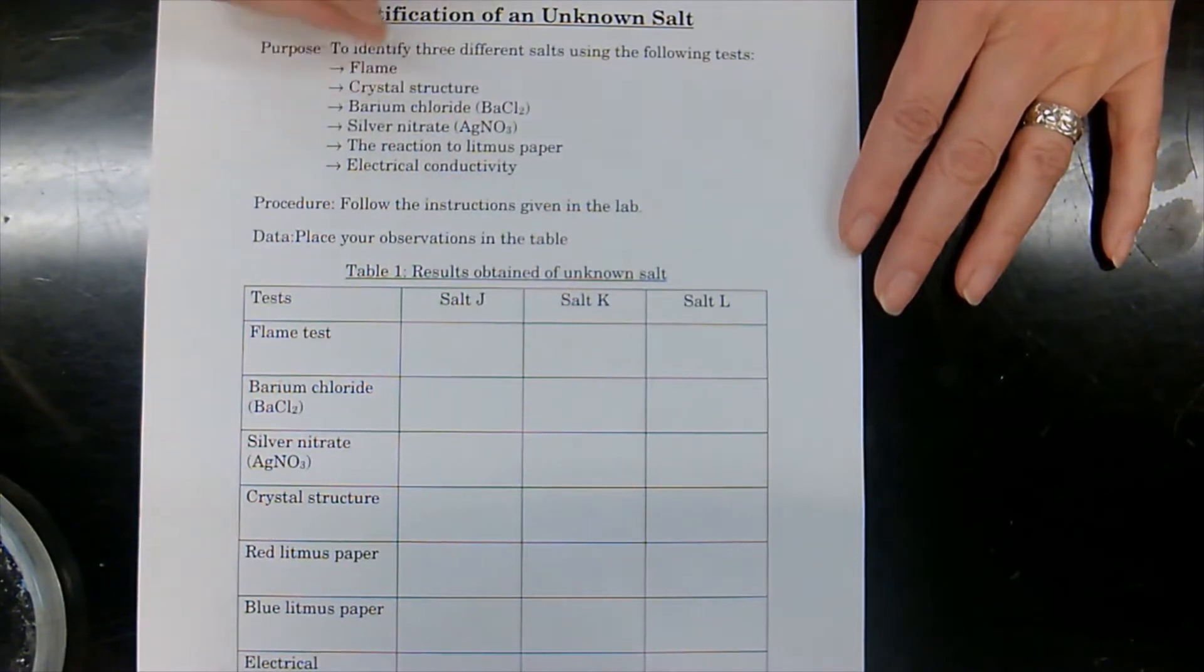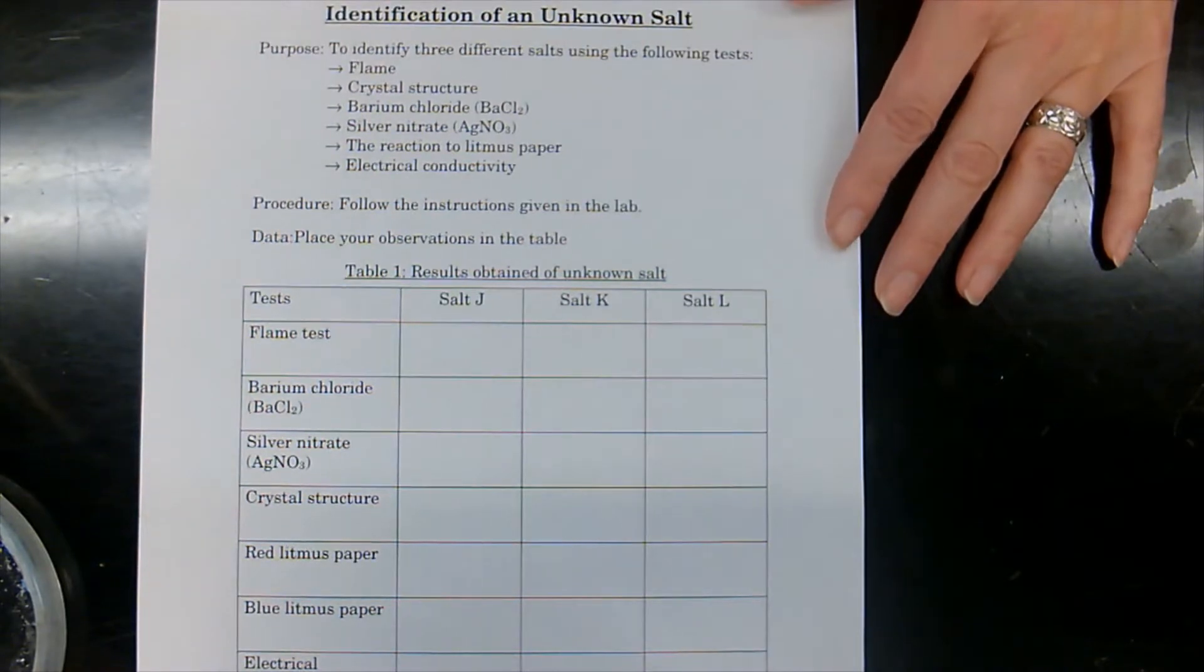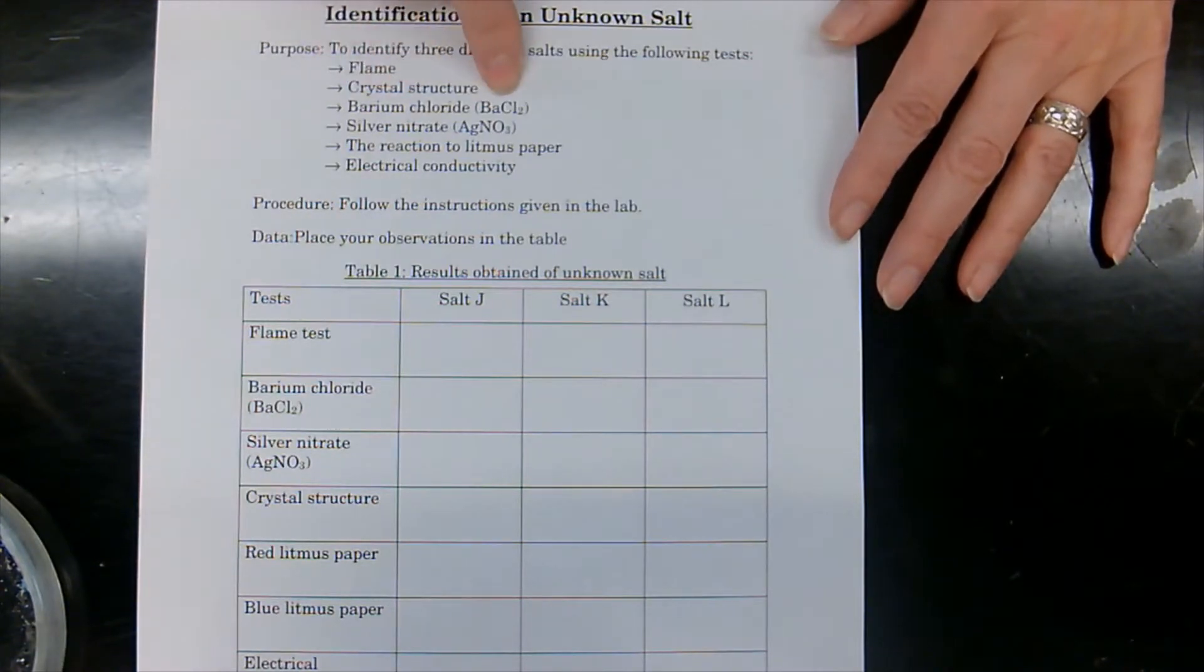We're going to try to figure out which ones they are by doing all of these tests. So the tests we're going to be doing, we're going to be doing a flame test, and we're going to be looking at them underneath the microscope to see their crystal structure. We're going to be testing with barium chloride.